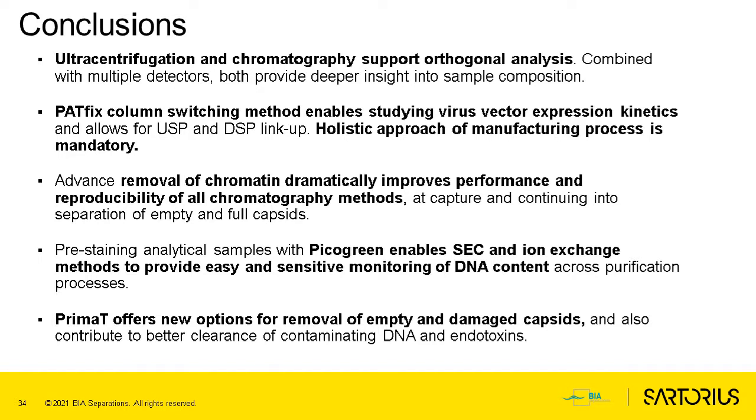When we are designing the manufacturing process, we really need to pay attention to chromatin, because chromatin would bring impurities which may be dangerous to our final product, especially because we may not see them. PCR may not detect them. It is the PicoGreen method with size exclusion column or any other column which improves the sensitivity for residual chromatin.